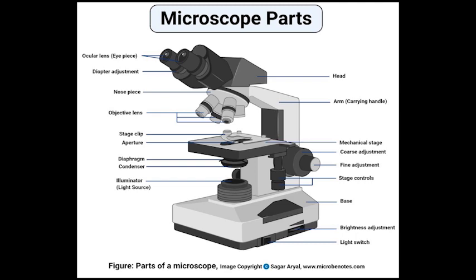The image may be projected directly into the viewer's eyes or onto a photographic film.